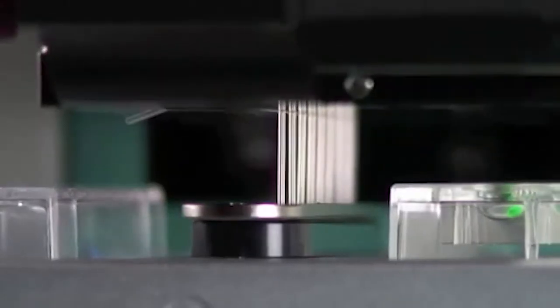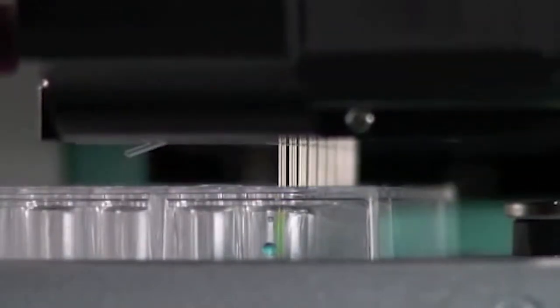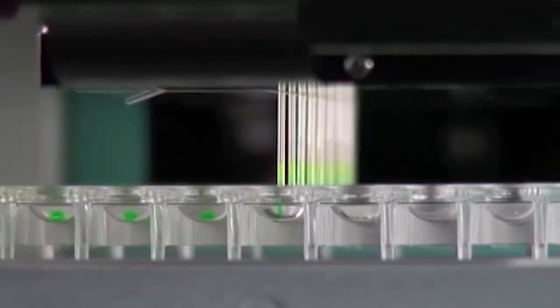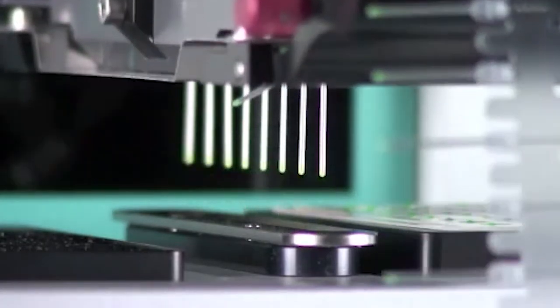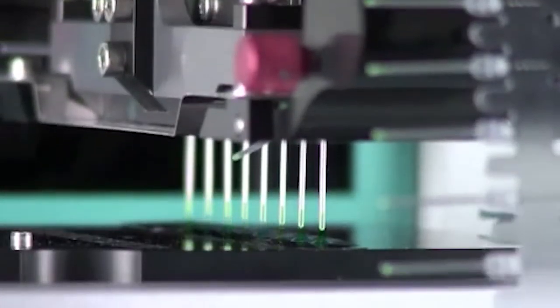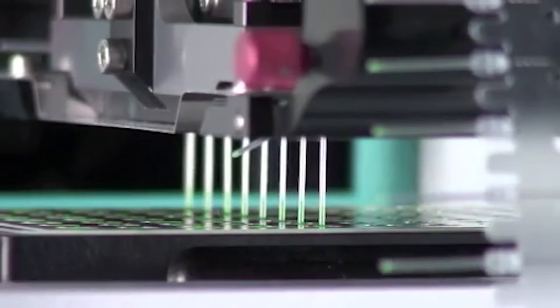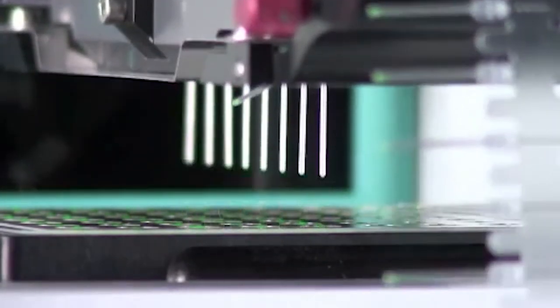This is ideal for micro-batch whereby we can pick up the protein followed by the screen and then dispense the two of them simultaneously beneath the oil forming a perfect drop. The same approach can be used for micro-seeding whereby we can pick up a small amount of seed stock followed by the reservoir solution and then dispense that directly on top of the protein drop. Volumes down to 10 nanoliters can be used in this technique.